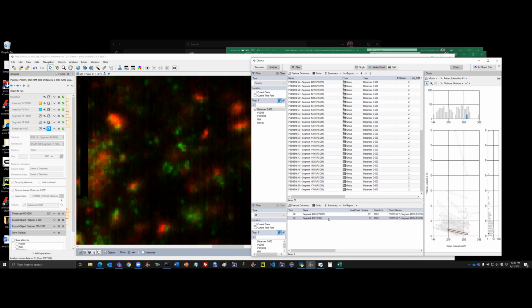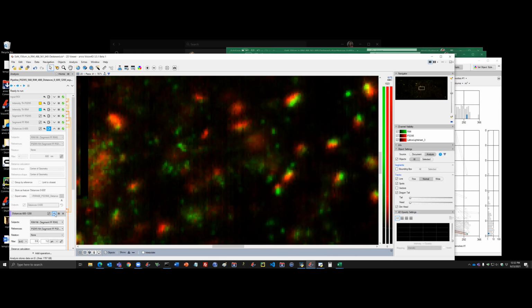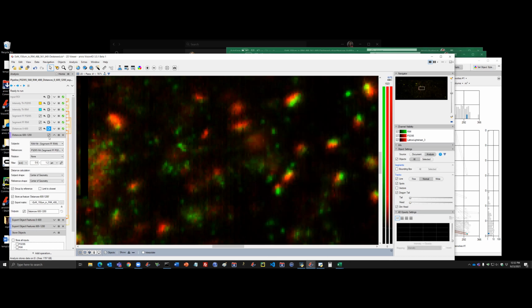And with this, I would like to show you that we are also able to bin the particles by the distance. What I mean by that is that now I am running a very similar operator, but instead of taking the closest particles, I'm actually taking a range from the distance we took before and doubling it, meaning that we will have two groups with different names for the analysis.